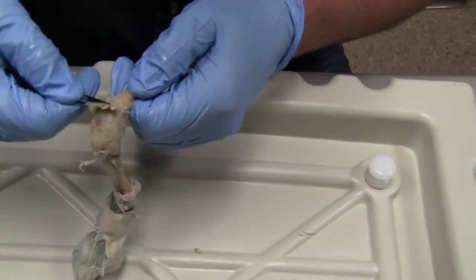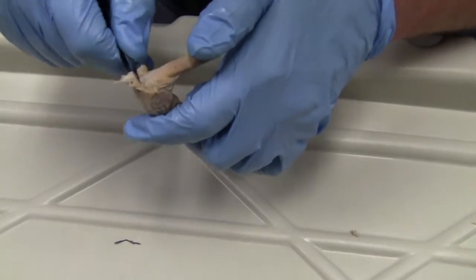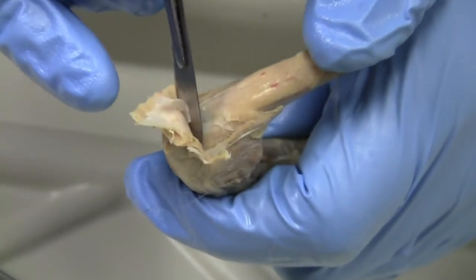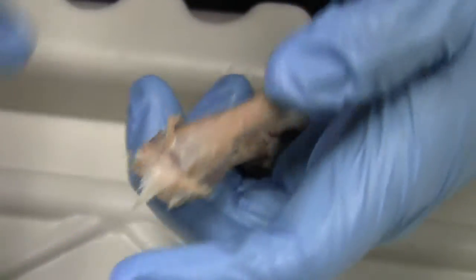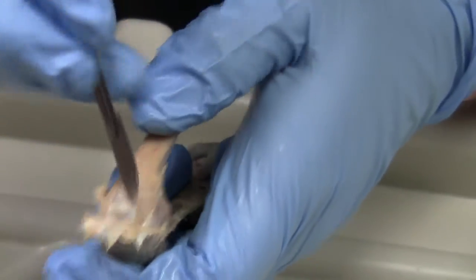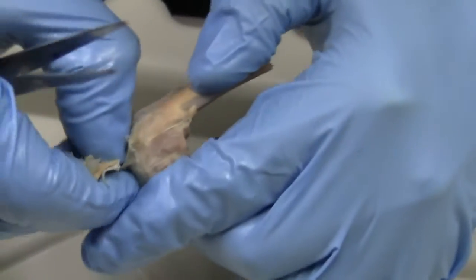So now what you want to do is slowly pull up on your patellar ligament and tendon, and then you'll see a little bit of connective tissue, and that's what's called the joint capsule or the stifle capsule. So what you want to do is just gently cut that away, and just kind of be patient a little bit. You don't want to work too fast and rip any of your collateral. So you see that just kind of go. So I just broke part of that joint capsule. So you just want to follow this on this little condyles part of your knee. And you can see that it opens up just like that. So I'm just going to pull it open with my hands.